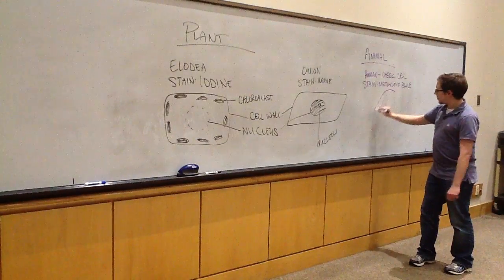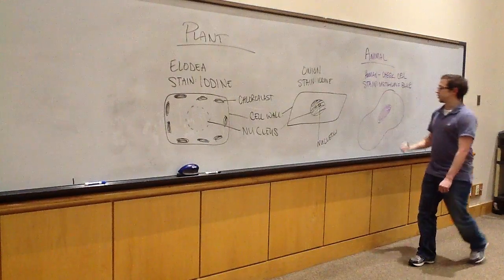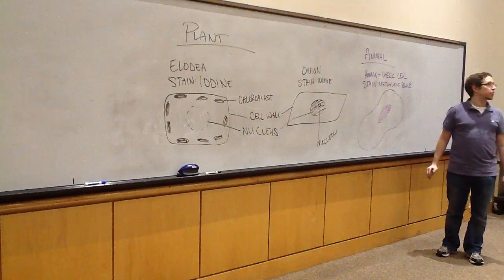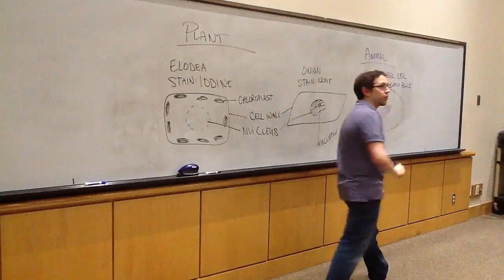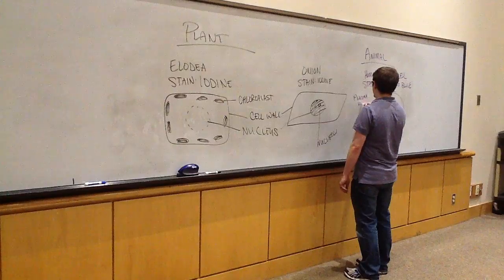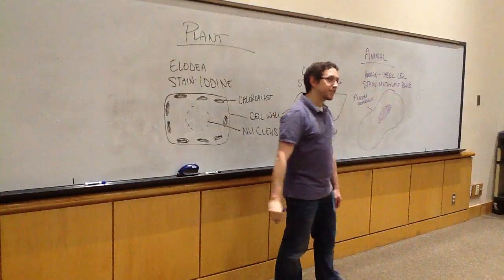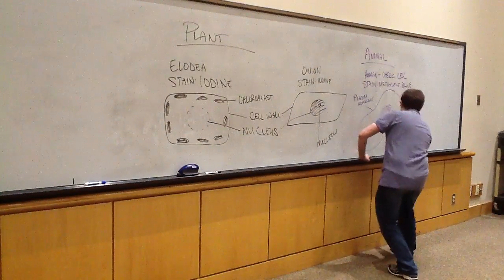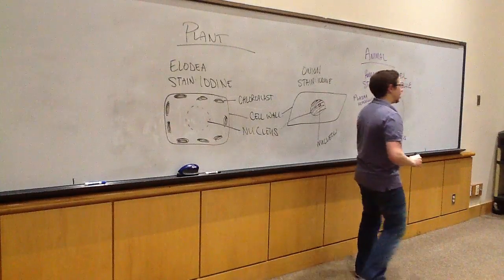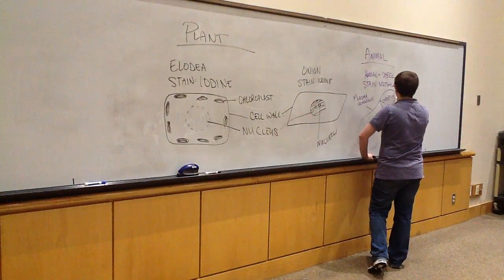All right, so these cells looked more like this. Might be a little difficult to see. They didn't have a nice rigid structure. Instead, they kind of have this globular mass. And that's because what's the outermost structure on an animal cell? Plasma membrane. Good. That central structure on the inside of the cells was the nucleus. Good. And then the region that exists between the plasma membrane and the nucleus is called the cytoplasm. Excellent.